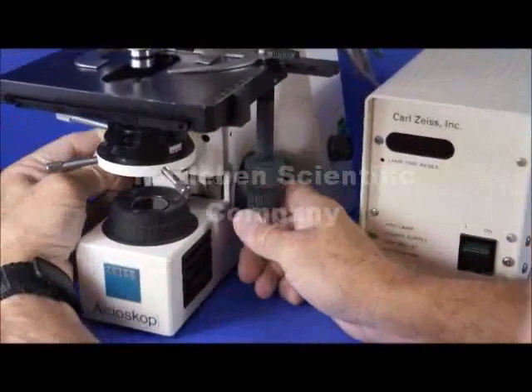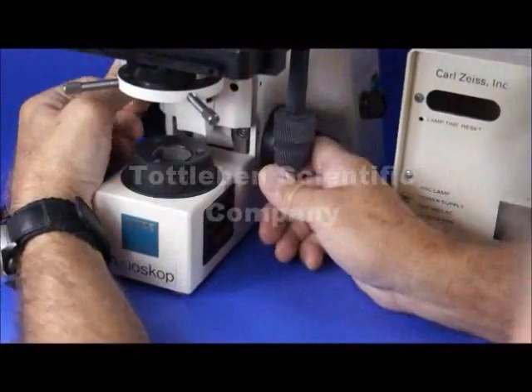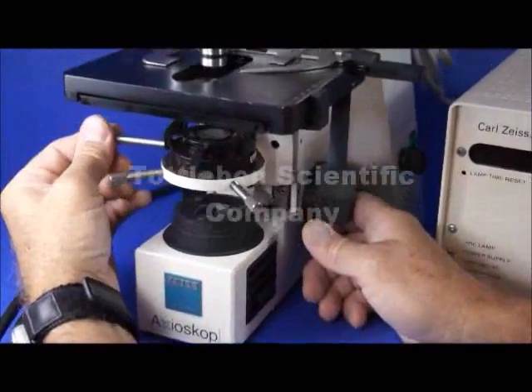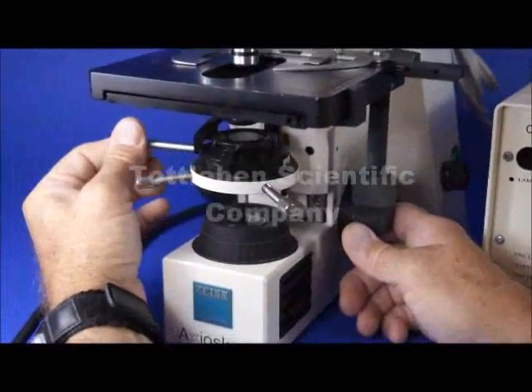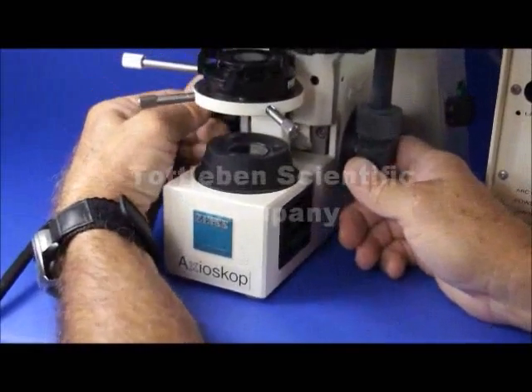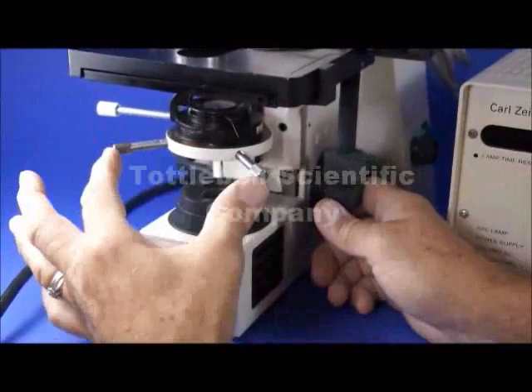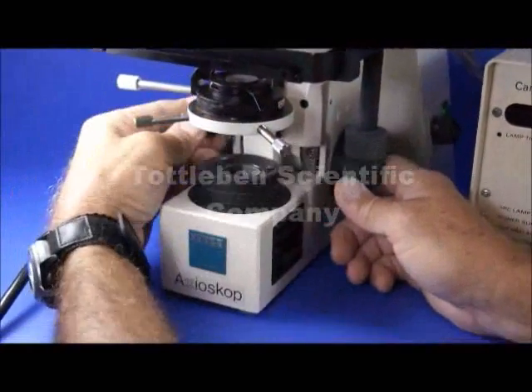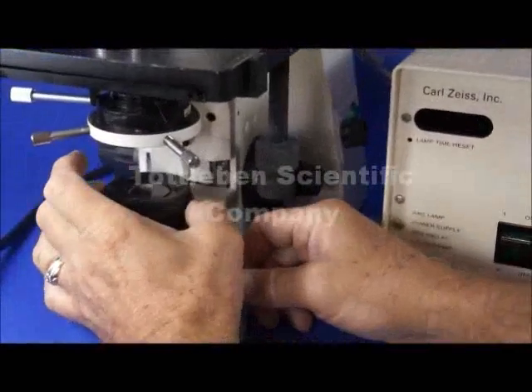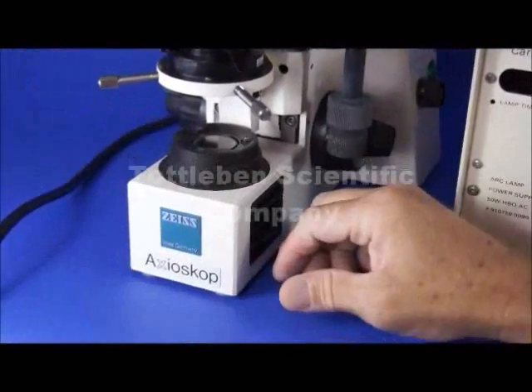A little bit lower is the condenser, and it's focusable, meaning that you can raise or lower it. It has a flip-out lens so you can accommodate lower power objective lenses like a 2X or a 4X. There's a centrable diaphragm that works beautifully, and it also has a centrable field diaphragm, so you can set this microscope up for true Köhler illumination.